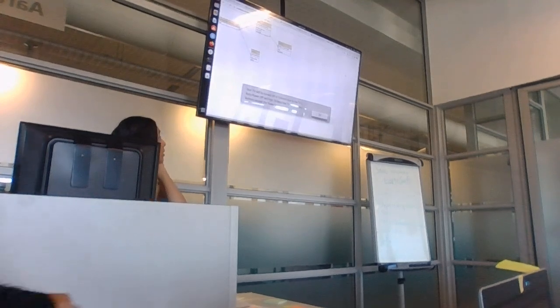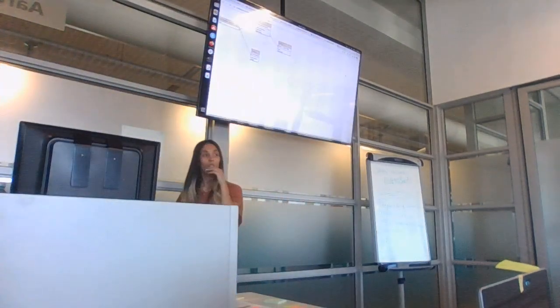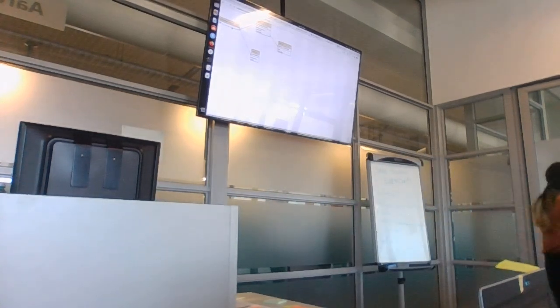The thing is, for me, I was expecting it to be one way, one direction. Now you see, from input, there are two. Mine has two inputs. Yours, let me explain. Let me now ask from yours. That's input. Yeah, this one. Did you have two inputs? If you have two inputs, then in your workflow you have put two inputs, so you can remove it. You can delete the second input, and then you will only see one input. So if you go to edit workflow.